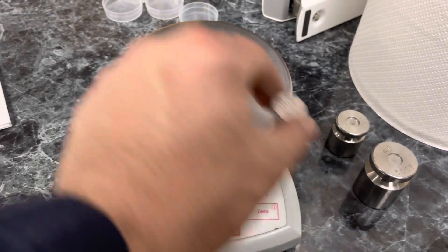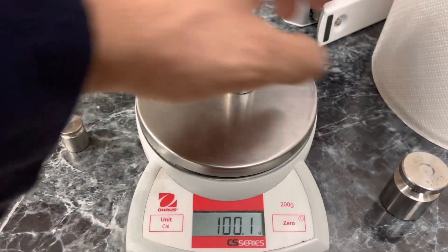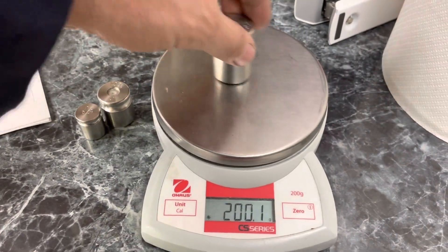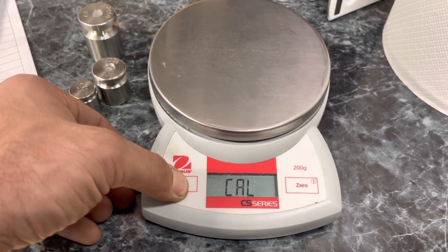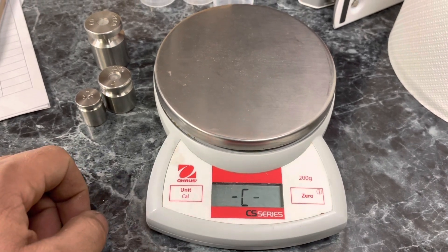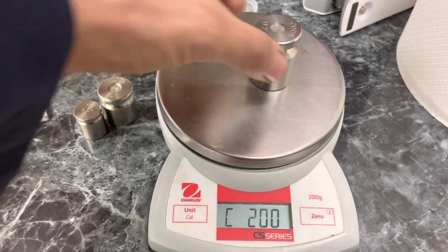Hello and welcome back to the channel. This is your Ohaus CS200 scale, and as you can see it doesn't exactly need a calibration, but for this video we're going to calibrate it. So we hold down the unit and cal button, it goes into the cal operation, we hit zero, and it does the zero calibration.